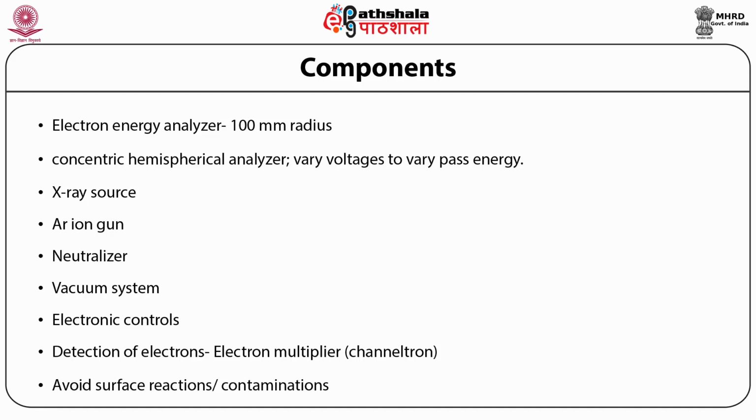The most important part is the electron energy analyzer, because this is the one which sends varying amounts of voltages to the target. So it varies from low energy to high energy, and gradually we can change this also.